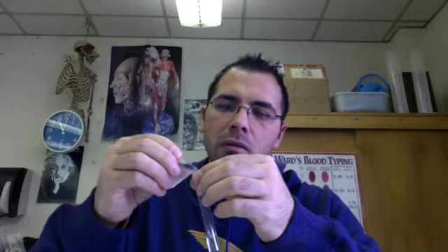So put that in. Got my medicine cup. It's going to probably make a mess. Almost, yeah, a little too much. It might be easier just to also fill up the medicine cups up to 5 milliliters. Anyways, that didn't make any sense. Ignore what I just said about filling the cup up to 5 centimeters. All right, 5 centimeters of my solution.